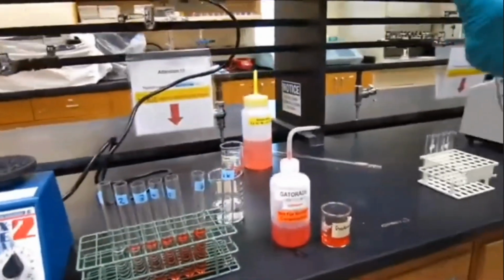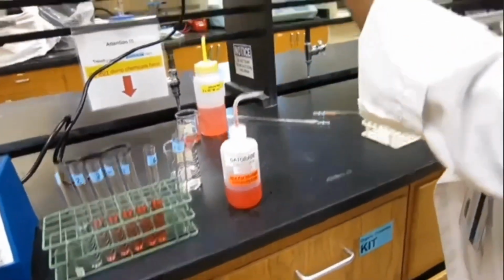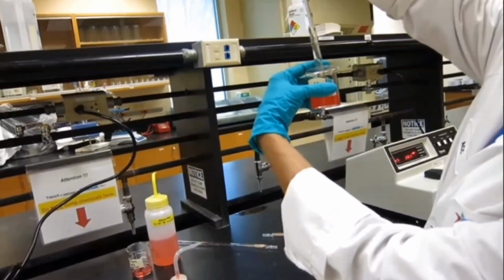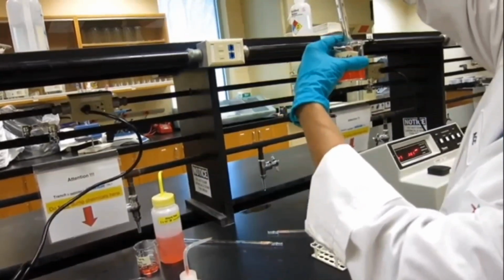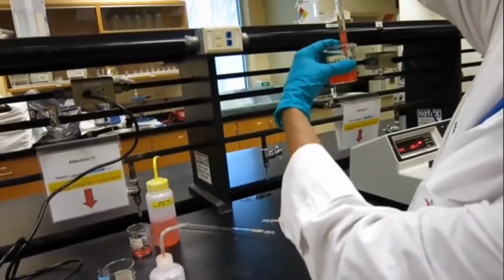So normally Gatorade is going to be a little too intense in color for the calibration curve and also for Beer's law to work, which I will explain in more detail in lab. What is Beer's law? Basically, we need to keep the absorbance less than 1.